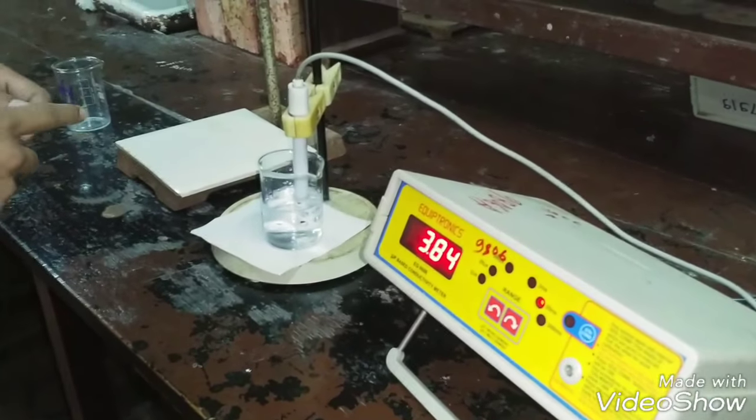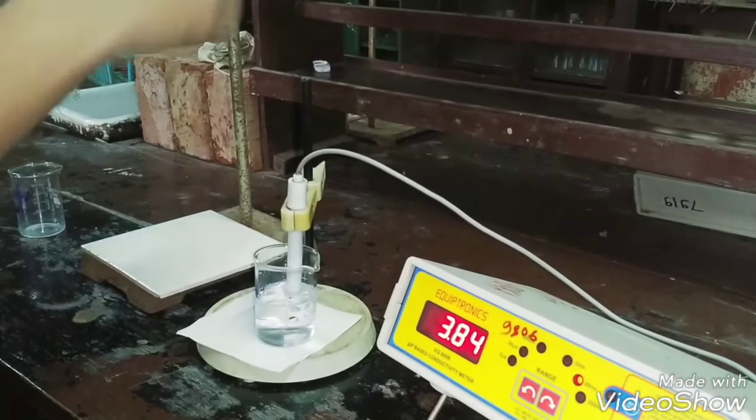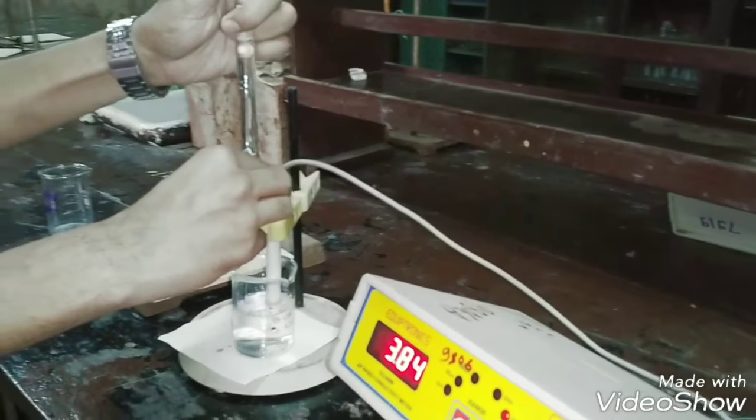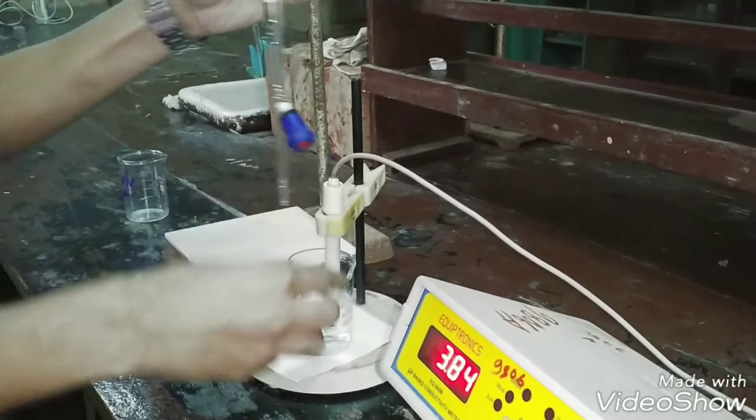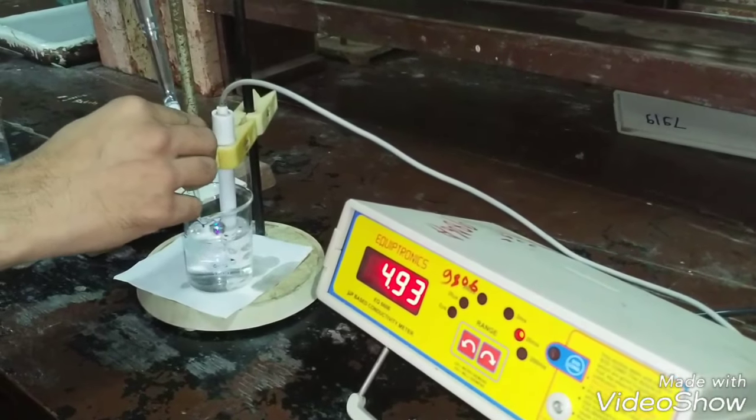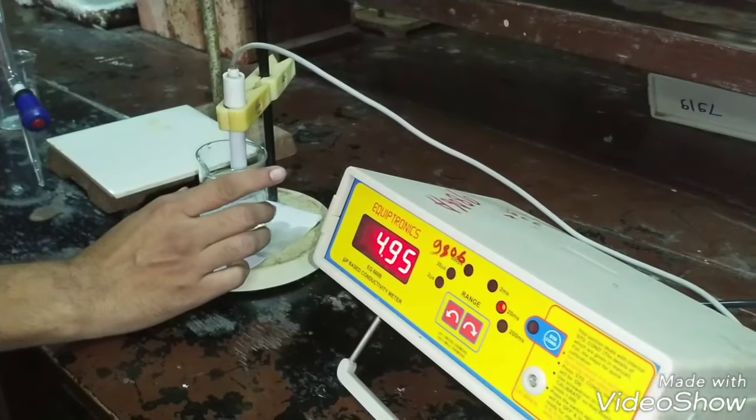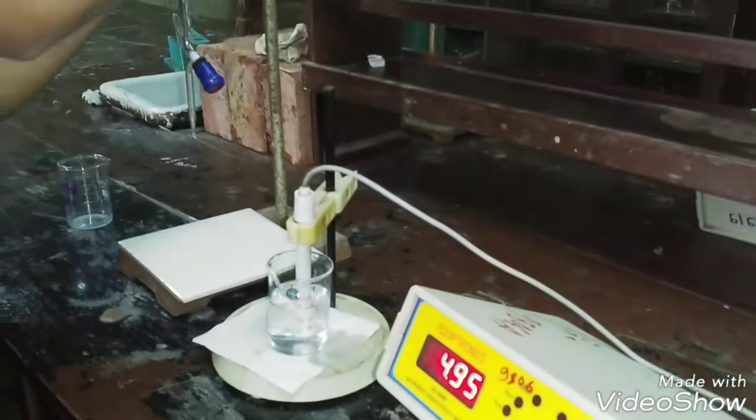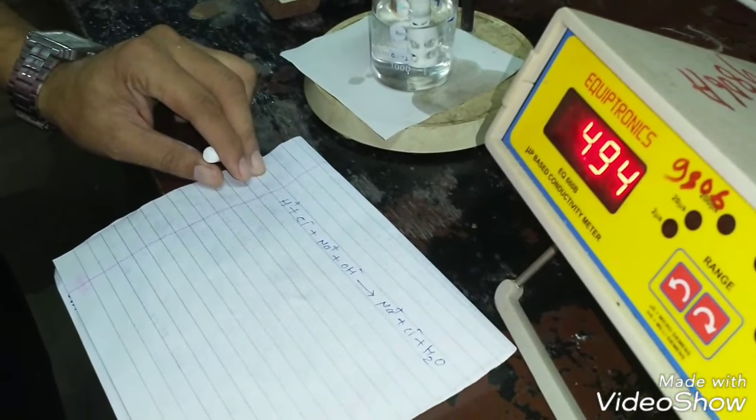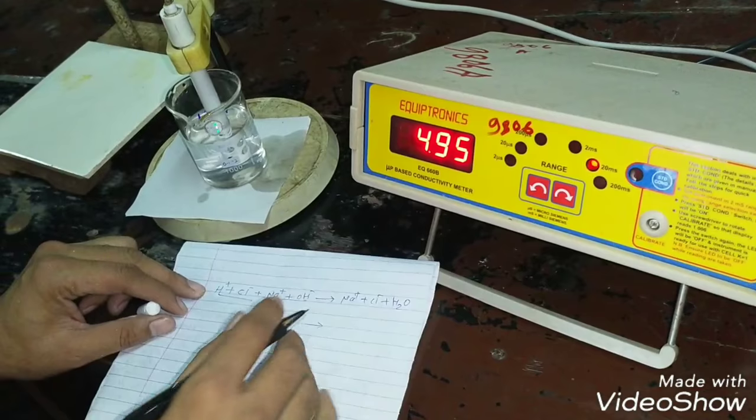In neutralization, the conductivity goes to minimum and on further addition of NaOH, conductivity starts increasing. After the neutralization point, due to further addition of NaOH, the conductance goes on increasing. And it is only due to excess OH- ions which forms NaOH. After the complete neutralization of HCl, the further added NaOH produces OH- ions and due to which the conductance starts increasing.